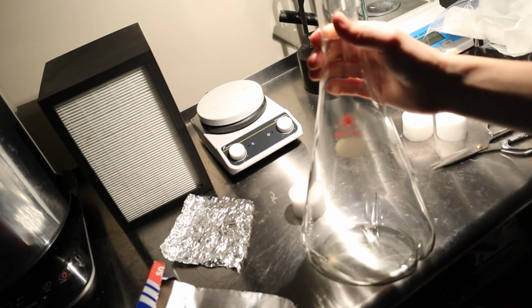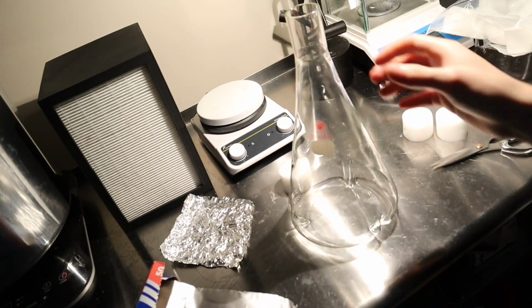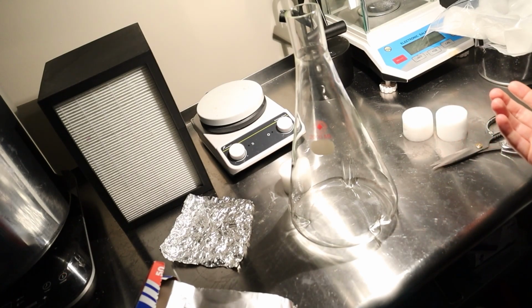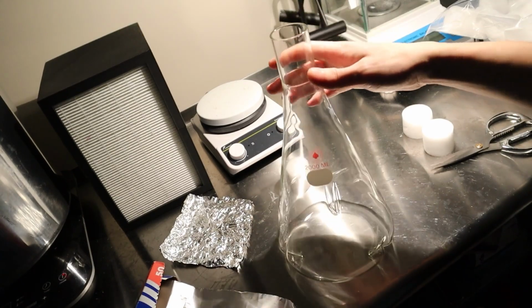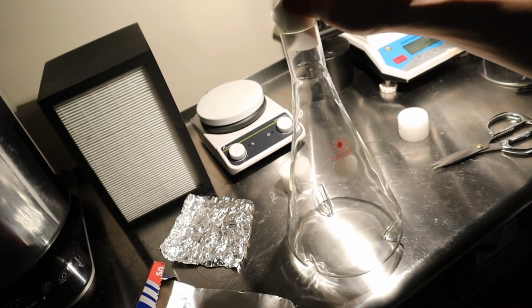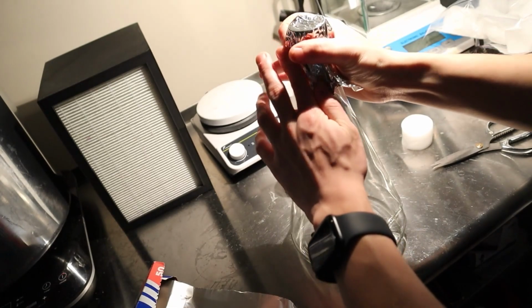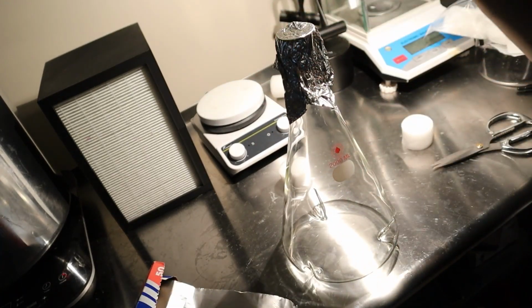So I'm going to transfer it to this, and hopefully this will increase my yield. I'm excited to find out if it does, although I probably won't because I'm not testing that at all. I have no way to know. But the problem is, its neck at the top is smaller, so it's much harder to get one of these in here. I could just go full redneck or typical and use some foil and just leave it like that. But I don't like this.